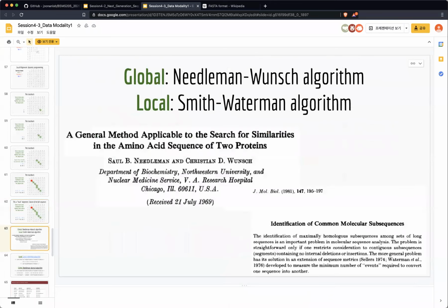So in the early days, in the 60s, 70s and 80s, people thought about how to do exact alignment for sequence information. At the time people came up with biochemistry and molecular biology development, people saw the future, right? So people talked about how we compare the similarity between protein sequences and DNA sequences, and they used algorithms developed for that purpose.